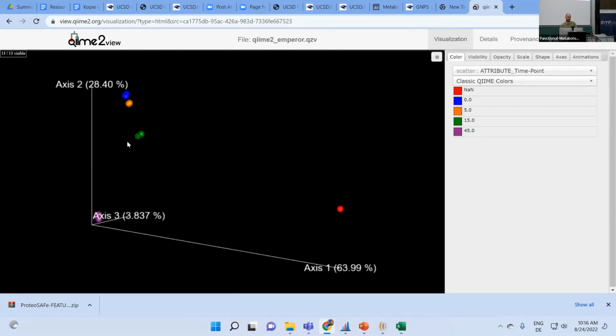And obviously I see very strong clustering within the 3 replicates, which is not surprising because those were technical replicates, not biological replicates. So that's also what I would expect.